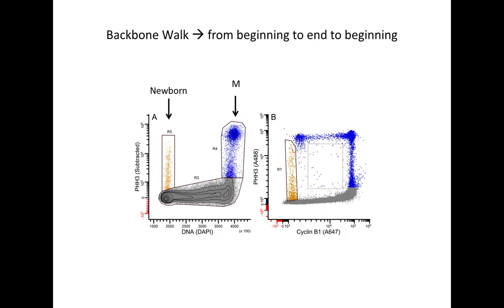The next step is to separate interphase from mitosis. That is shown in the panel on the left. Phosphohistone H3 and many other heavily phosphorylated epitopes increase dramatically when cells enter mitosis. For this epitope and others, dephosphorylation occurs in late mitosis and continues through immediate early G1. Thus, we can segment all M by gating all 4C cells with elevated phosphohistone H3.